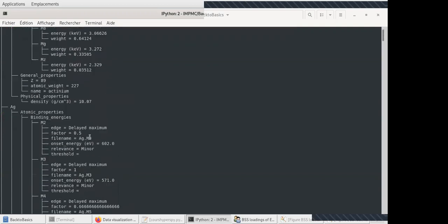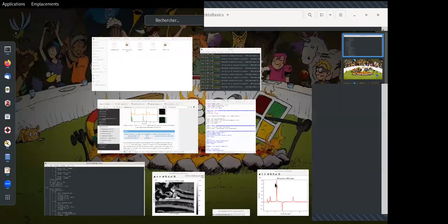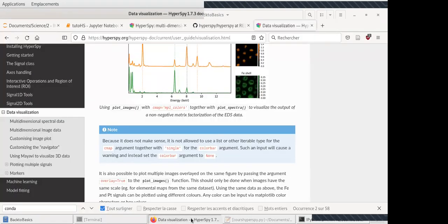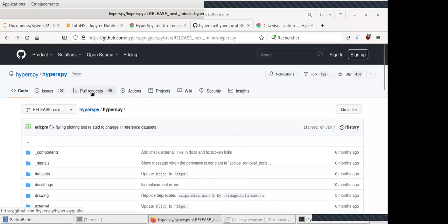So this is great — at least from what was shown, you can read and transfer data from proprietary formats. The problem with those formats is they are proprietary. For example, the Bruker software is 1000 euros, and some older software like the CD-based install doesn't work on Windows anymore. At least now you can read the data and then process it with open-source tools using basic functions.